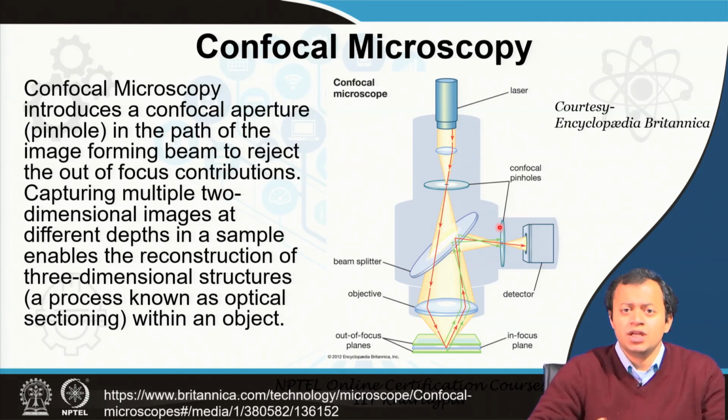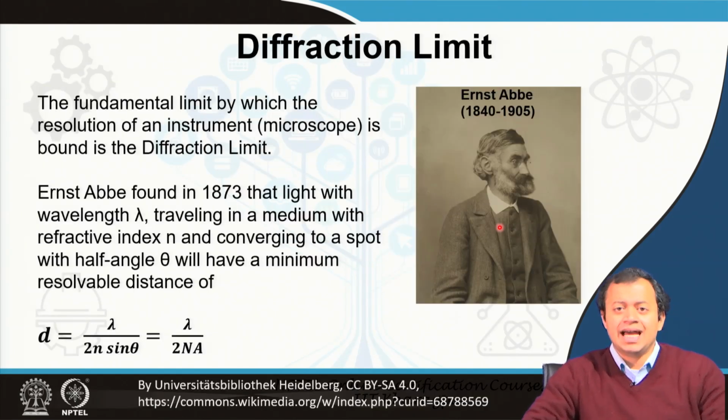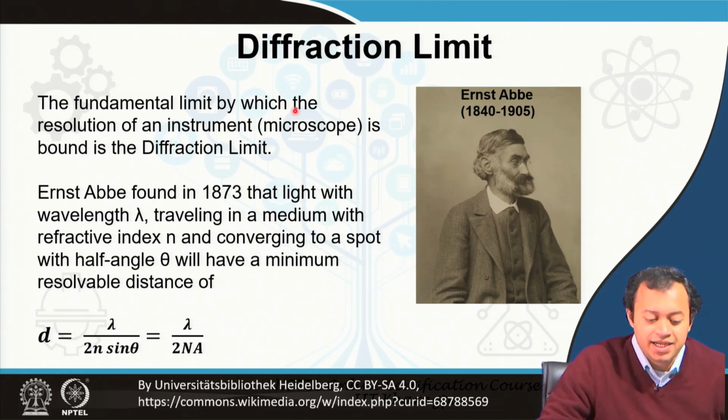Thereby you increase the resolution and you try to look into more and more different materials, different samples. However, there is a small problem, and that is the diffraction limit. There is a fundamental limit on which the resolution of a microscope is based.